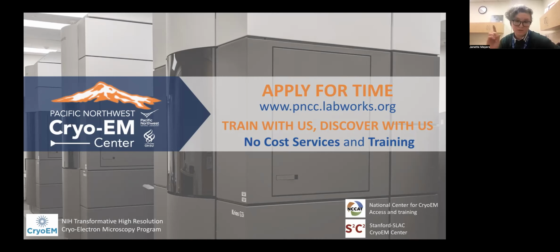We have one Arctica, 4 Krios, all have K3 cameras, we have a Falcon 4i, 3 energy filters, and we have a Vitrobot and a GP2 for sample prep. So hopefully we'll hear from some more of you soon.